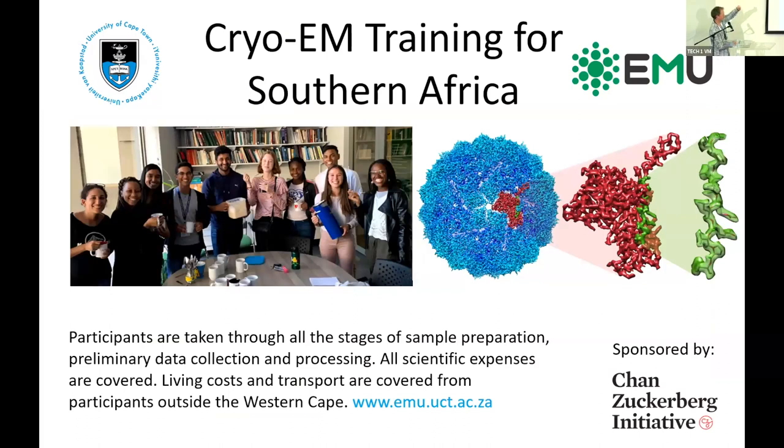So for those who can apply, this is our program. You come to the program with your own sample. I think that's important. And you go home with processed data that you can publish. That's the point of it. So we're not teaching a workshop that people are just kind of interested in and come to. You get accepted to the workshop on the basis of the quality of your samples.